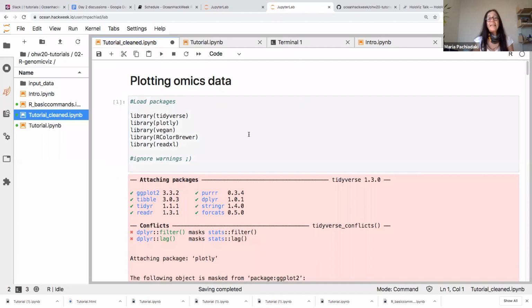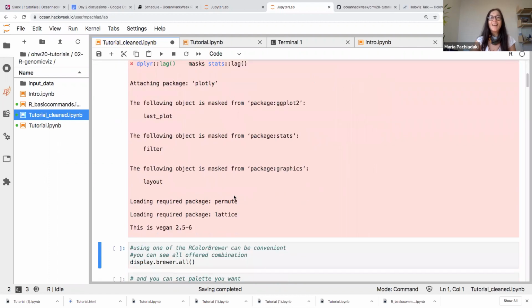Okay, we load the packages, and there are actually packages that can plot the data for you. While Felipe was putting the R kernel together, we chose to go with packages that are already in CRAN. Other types of packages like Phyloseq or Ampvis2, which do the processing for you, you can get from GitHub, and it might have been a little more challenging to implement, but we will produce all the graphs we need with those basic packages. Ignore the warnings, nothing serious.